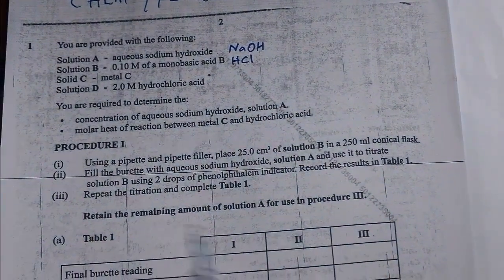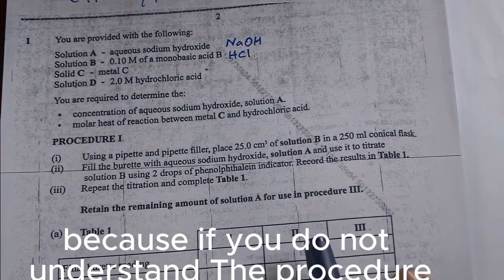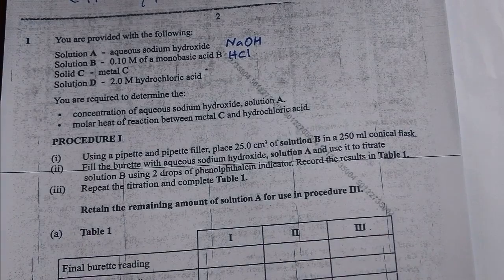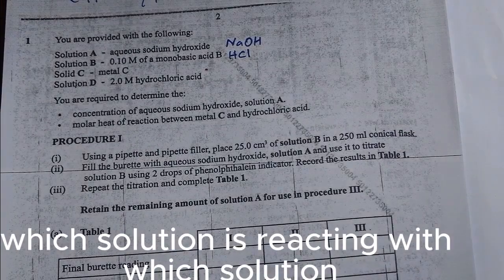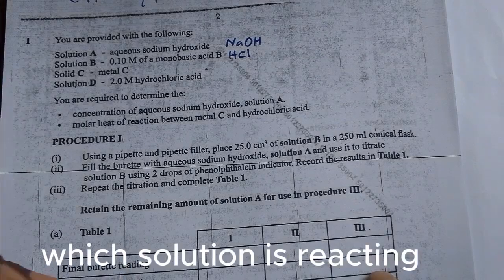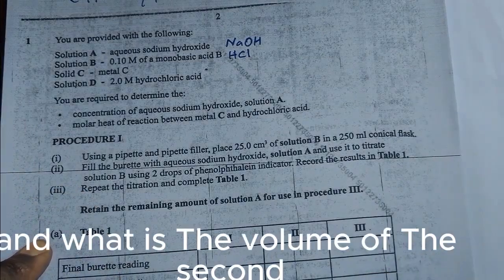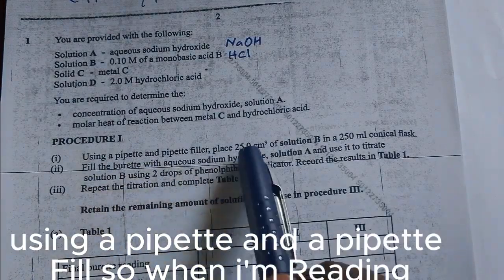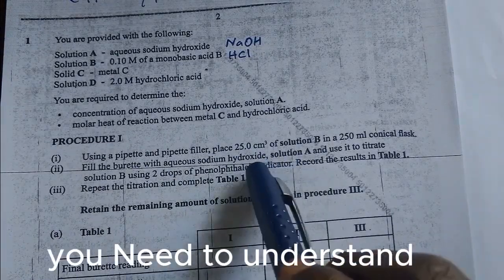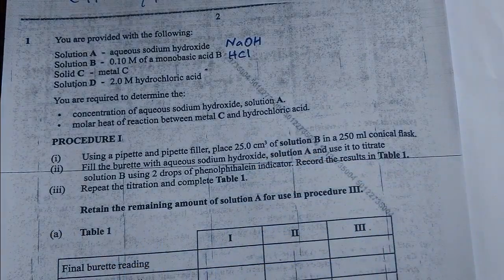Procedure 1. Using a pipette, it is important that you understand the procedure, because if you do not understand the procedure, it is going to be difficult to handle the question. You should be able to know which solution is reacting with which solution. Which solution is reacting? What is the volume of the first reactant and what is the volume of the second? So those are the things you need to understand. It is from the procedure we will be able to answer the questions correctly.